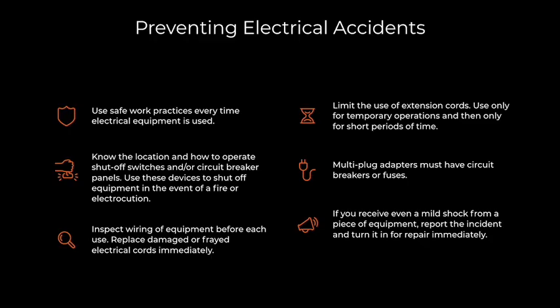Limit the use of extension cords. Use only for temporary operations and then only for short periods of time. Multi-plug adapters must have circuit breakers or fuses. If you receive even a mild shock from a piece of equipment, report the incident and turn it in for repair immediately.